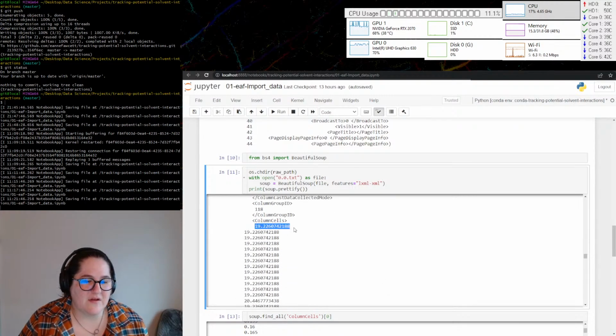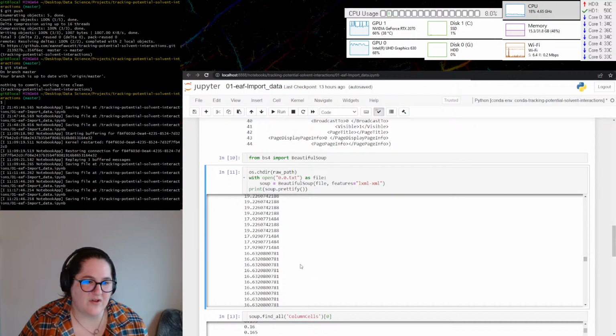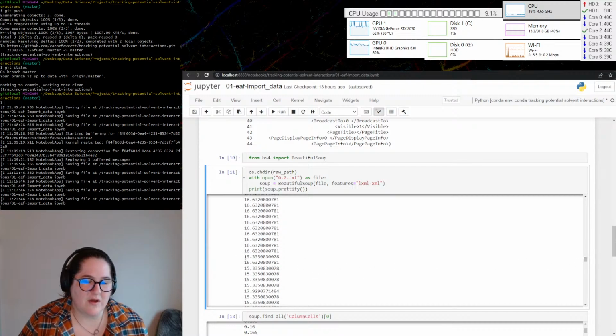Now this readout is going to be the temperature, and this is in Celsius. So you can see that this is below room temperature. And scrolling down over the 7 minutes, you can see that there's a depression here where it goes from 19 down to 15. And then we have this crazy spike. And that's kind of what GC is all about, right?